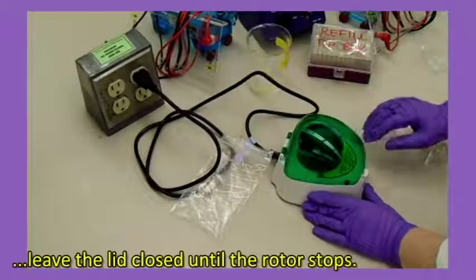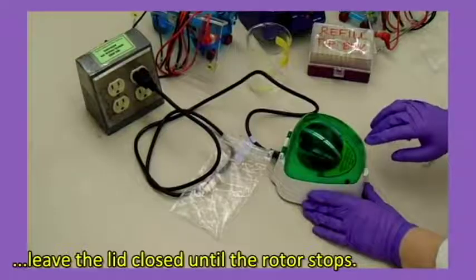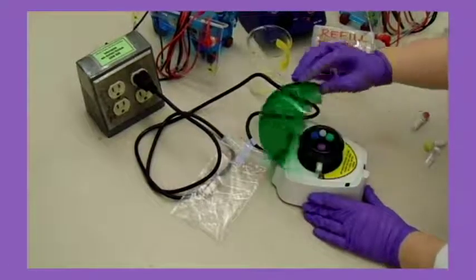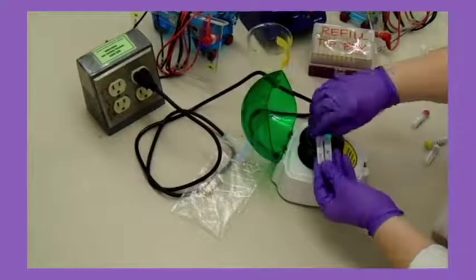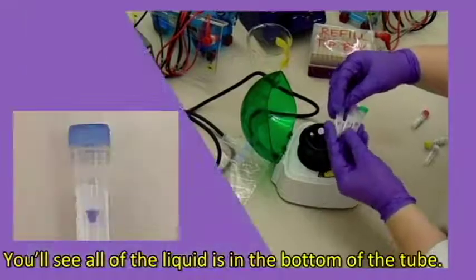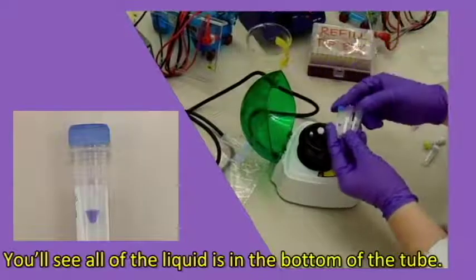When you turn it off, leave the lid closed until the rotor stops. You'll see all of the liquid is in the bottom of the tube.